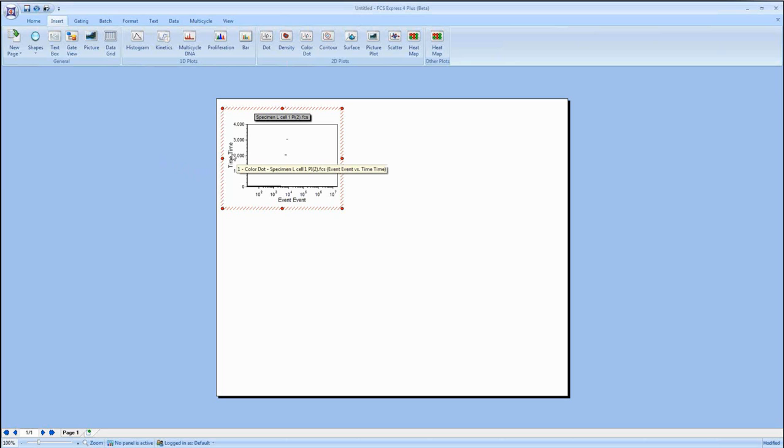And if you want to change any of the parameters on the axis in FCS Express, you just click and hold on the axis, and you have access to all the different parameters here. And it looks like with this data set, we acquired BL1 through BL3, VL1 through VL3, and we did the area, height, and width parameters for all of these things. So what I'm going to do is start with side scatter versus forward scatter area.